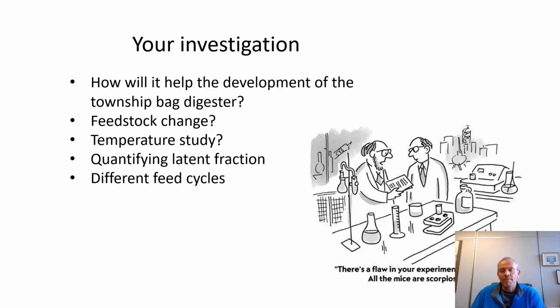So then, the plan is that each of these 7 fermenters will test something specific. First of all, you need to get your baby healthy and your biogas production stable. Only after I've signed off on your stability can you start varying the parameters of your run. It's important not to vary too many of them together. So you need to come up with a plan for how you want to execute your experiment.